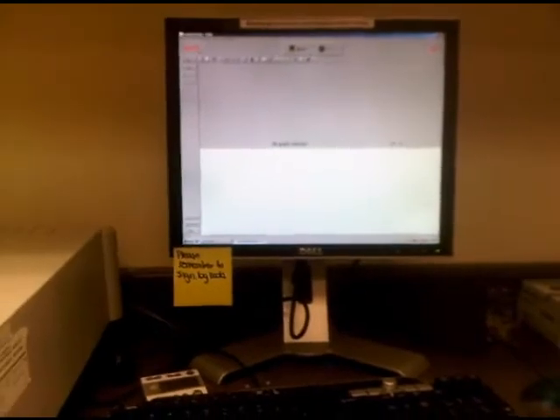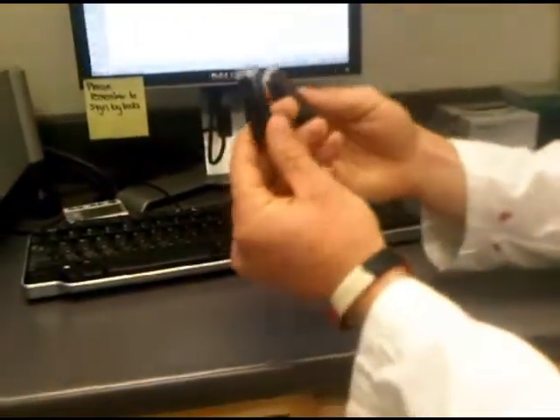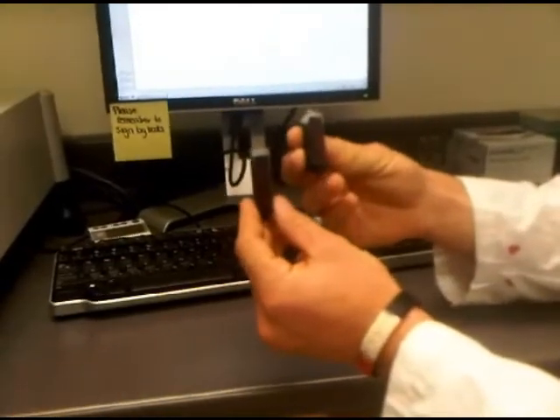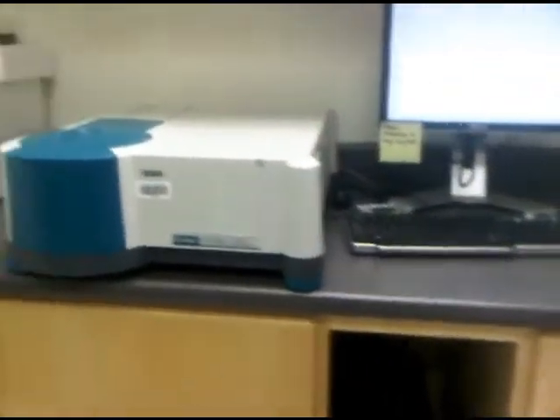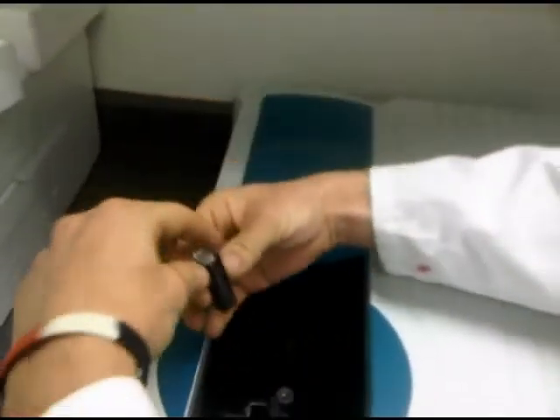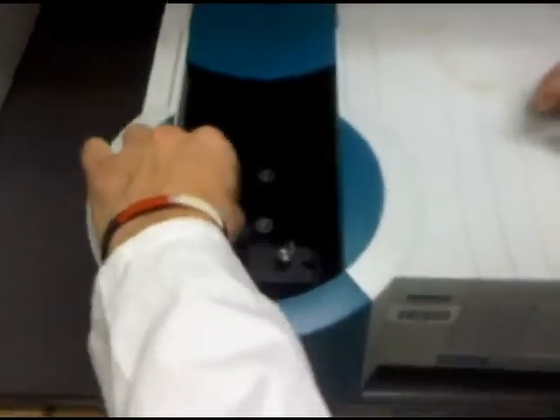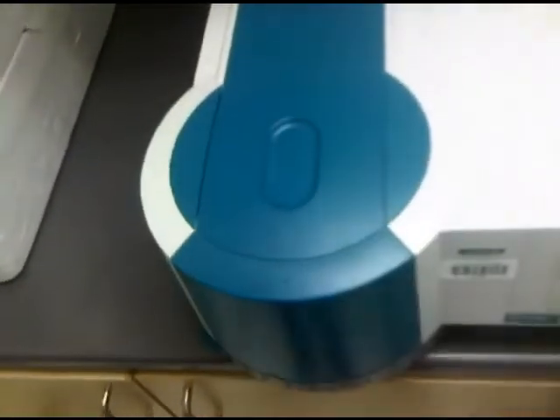You have to ensure that if you use different cuvettes, you want to make sure they are identical cuvettes, because they could have an impact on the result. So then you put your solution in, open up the top here, and insert with the open end of the cuvette like so. Then shut it, click Start, and wait 10 minutes — it's going to give you your graph.